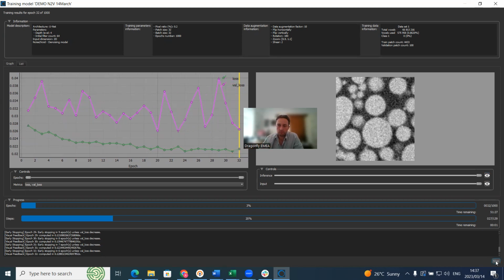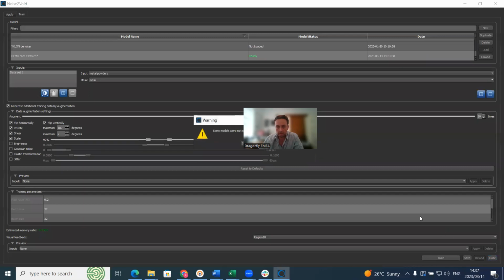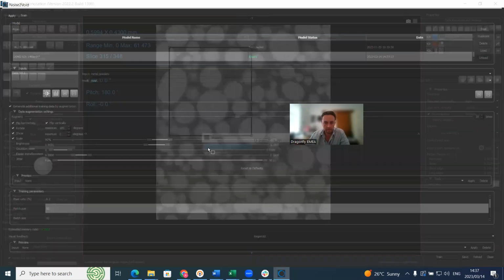Okay, that's all for this video. I think I'm going to stop it there. And just to close that, let's just say we want to save the changes, yes.